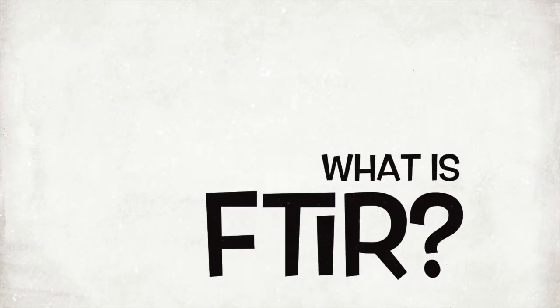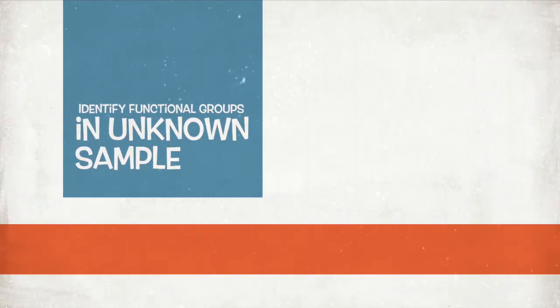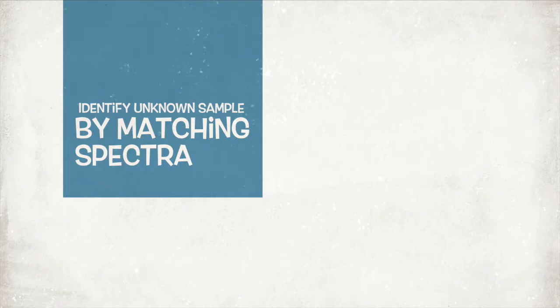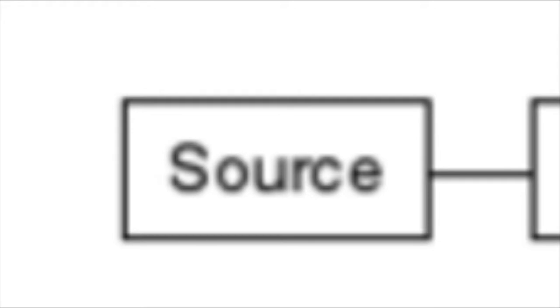FTIR, also known as Fourier Transform Infrared Spectroscopy, is carried out to identify functional groups of organic and inorganic products. We can also use this technique to identify compounds by matching their spectrum obtained with a known spectra of reference materials.